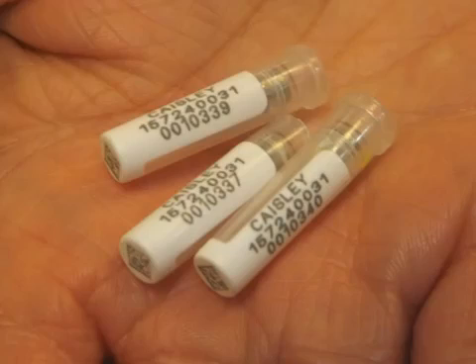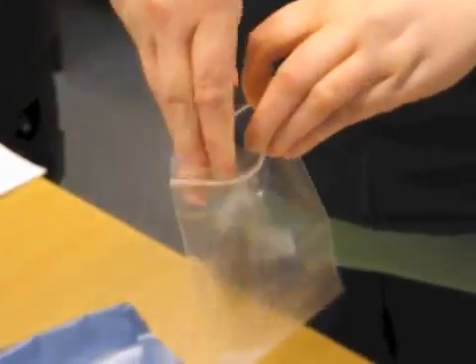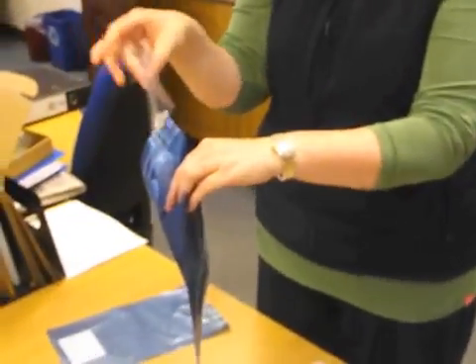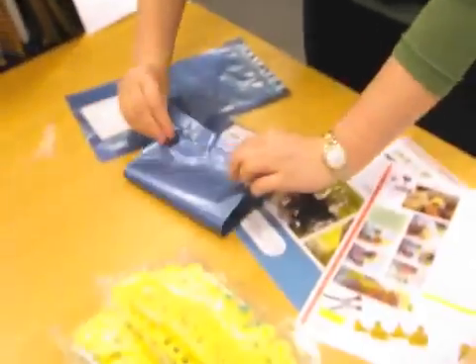When you have collected a sample, it can be stored for up to 2 weeks in a cool, dry place. As soon as practical, group all samples and place them into the clear jiffy bag and seal. The blue envelope has a white label for your return address. You fill that in. It has a full address label for the approved lab, in this case, AFB at Stormont, Belfast. Place the jiffy bag into the blue postal envelope, tear off the strip and seal the envelope. This is now ready to have a stamp affixed and to be posted to the laboratory.